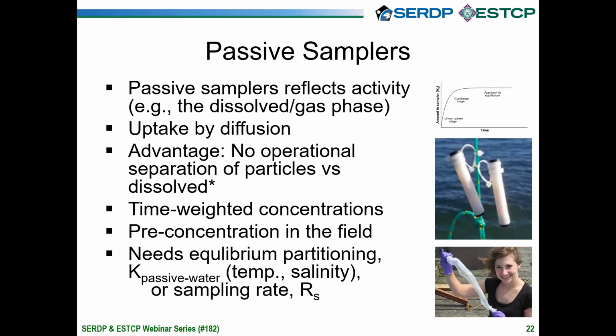I think the other part that we've realized, particularly for PFAS, is that the samplers help us actually do the pre-concentration step in the field. So typically, if you do a water extraction, you often take it to the lab, you filter it through a cartridge, and then you extract the cartridge. In this case, we basically take this cartridge into the field. And so that helps us with less work in the lab, less interference from other matrices.